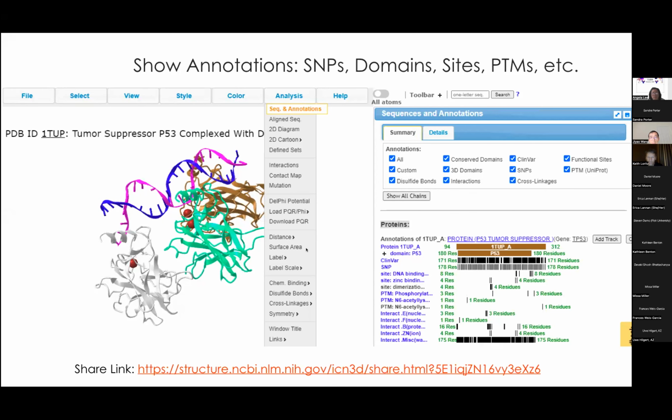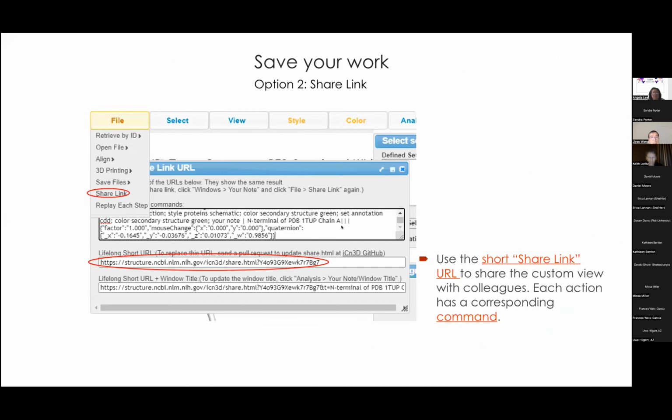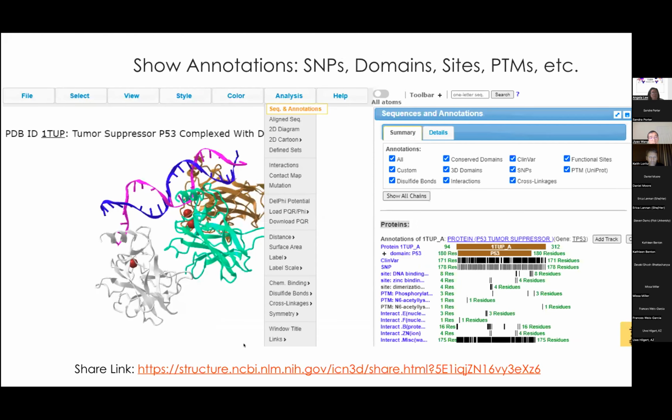Okay, I think so far, if you have some hands-on experience, that's pretty much all the basic stuff. Now I'm going to cover more advanced ones. You can just listen to it. If you're interested, you can click the links. Otherwise, it's introducing a little more advanced features.